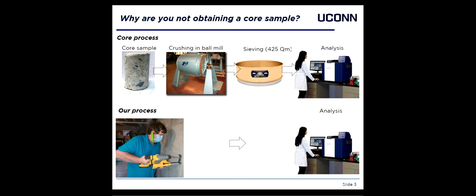In our process, the powder is directly obtained with a drill, and we sample several locations at once to capture a representative section of the foundation.